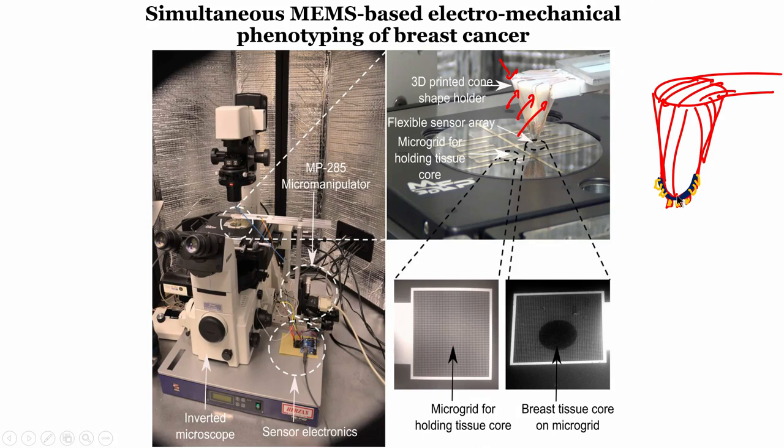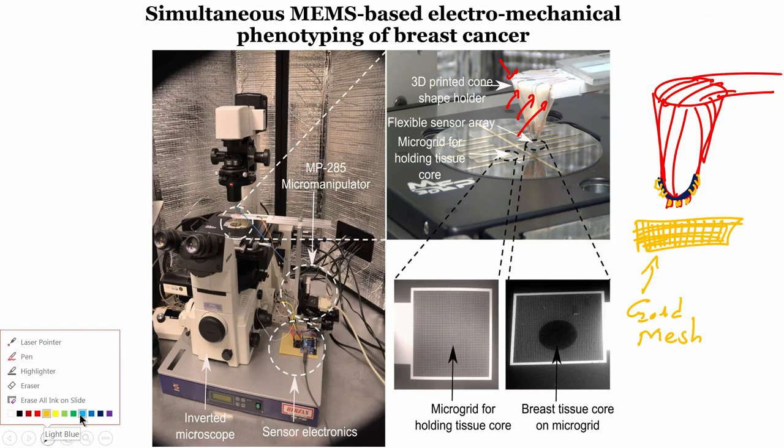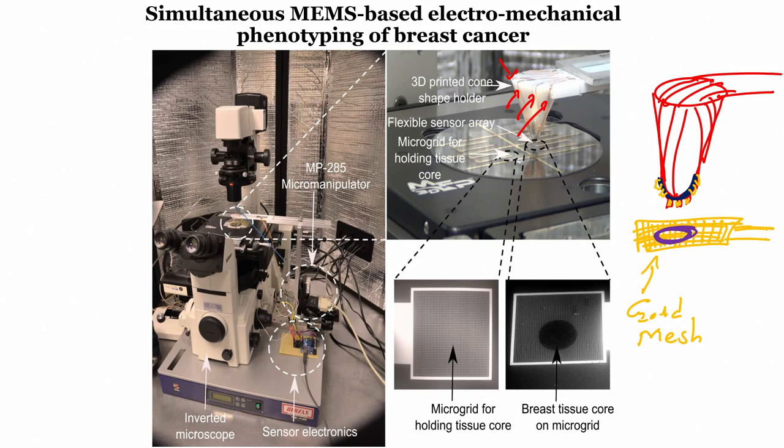Now, if I have a bottom plate which is conductive like this, which is a gold mesh, and on that I place the tissue, so I can have a contact to that. This is the contact pad. So what will happen if I indent this?